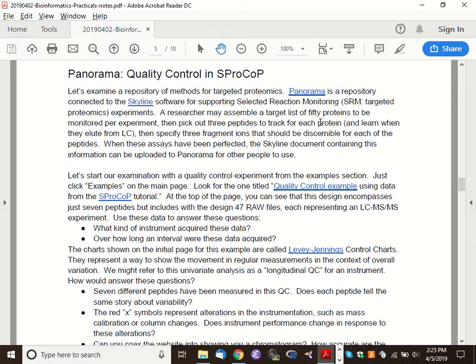That's an ideal chromatogram. So the higher the signal you get from that sample, the more of that peptide you assess there to be. Now, because this peptide is showing up at a given time, all 3 of these transitions that we've predicted for it should rise and fall together. It's frequently the case that in a complex mixture, you will see other peptides that are the same combination of precursor mass to charge and fragment mass to charge.